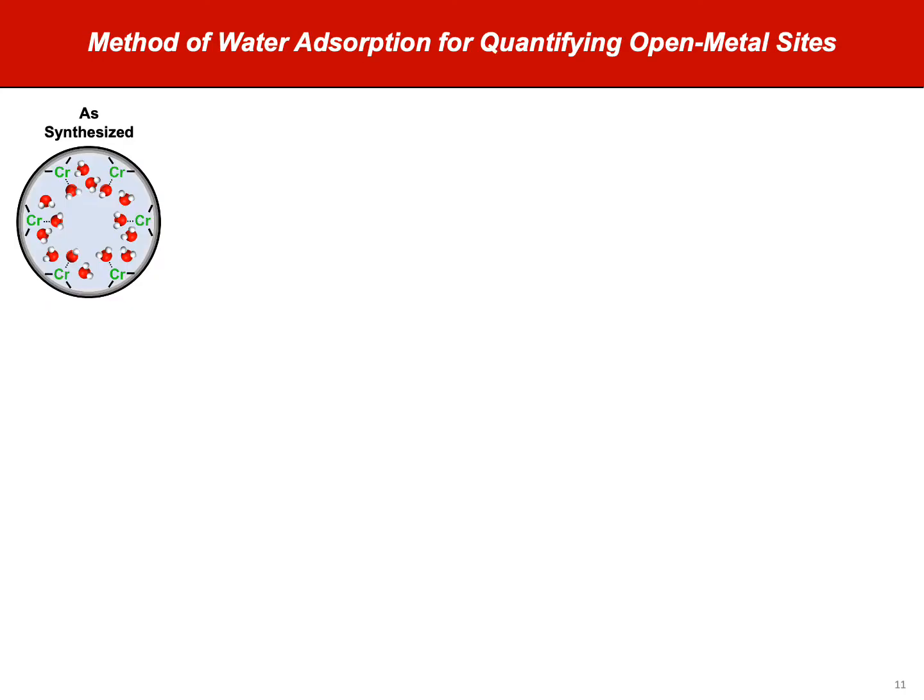So here's the protocol we went through in order to test this hypothesis. We look at the as synthesized MOF here with water molecules adsorbed onto the chromium sites and elsewhere in the material.